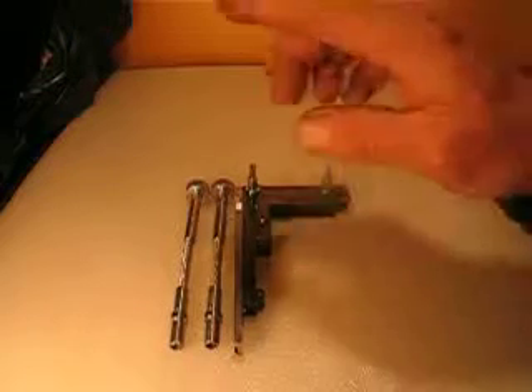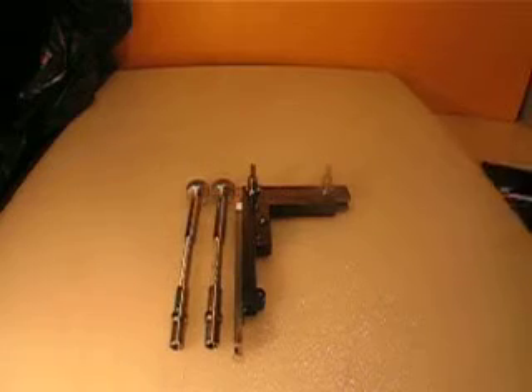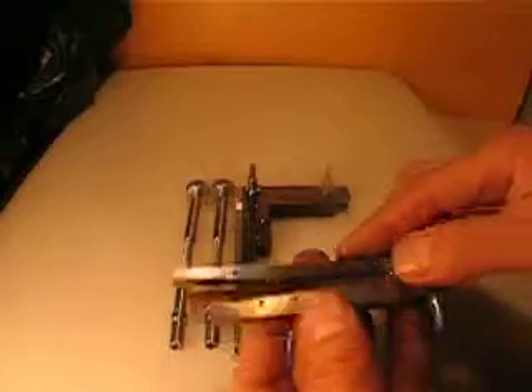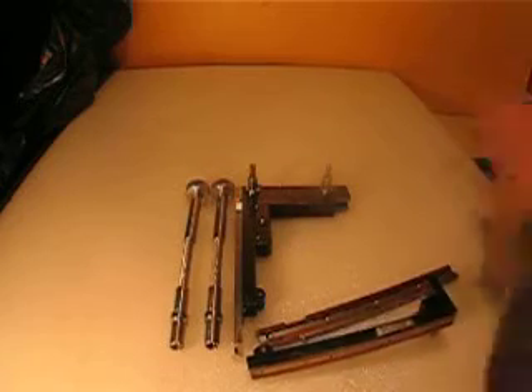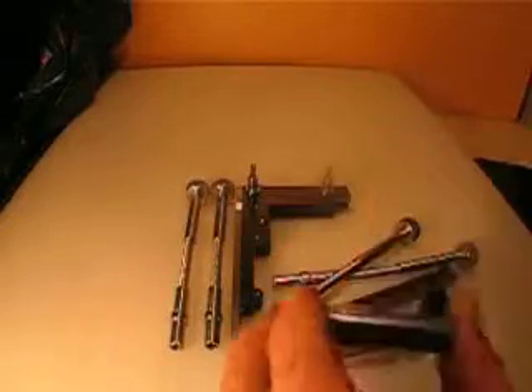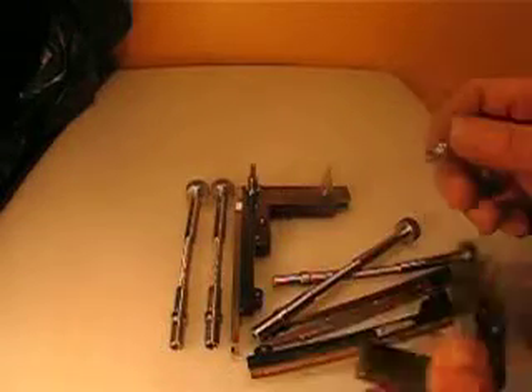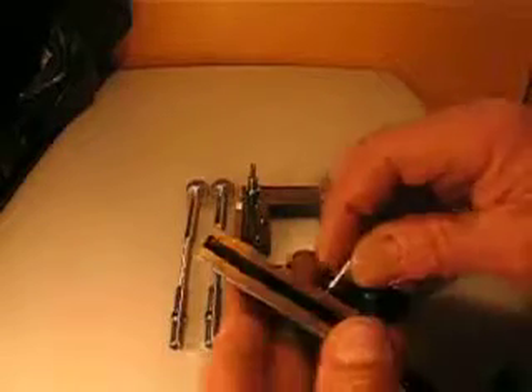Now let me bring the other one and show you. These are the parts that are coming out from the other part. There's two handles. This is the rack. This is the pinion that goes inside the other part, like this part here.